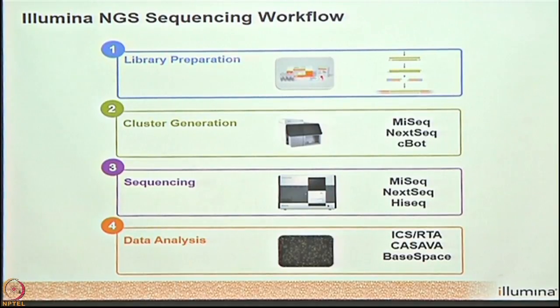The very first step involved in all the sequencers is library preparation, which is followed by cluster generation. Then comes the sequencing, and the final step is the data analysis part. So first is the library preparation. It's common for all the platforms. Though the sequencers are different, the concept remains the same.